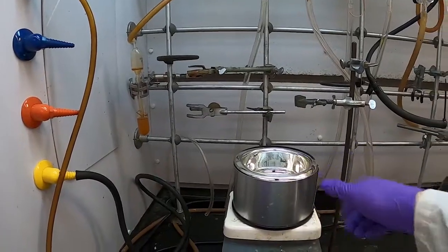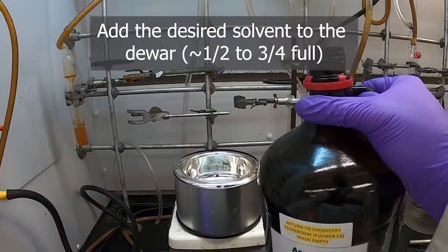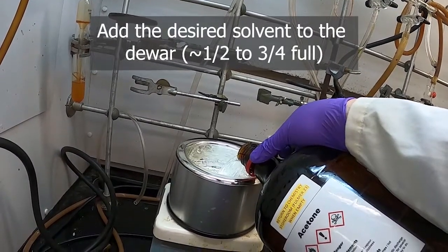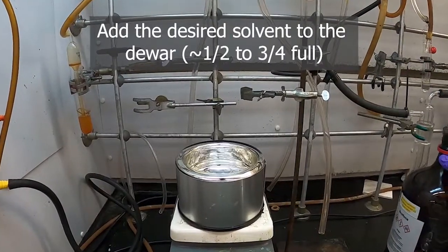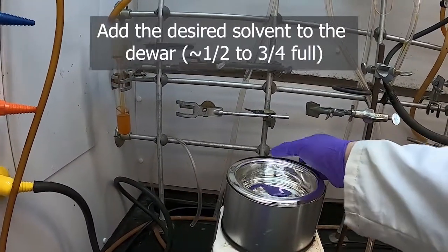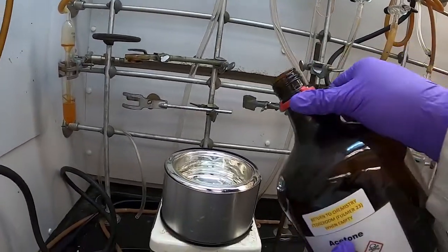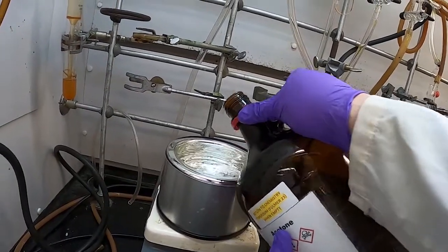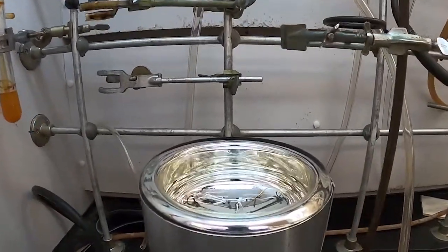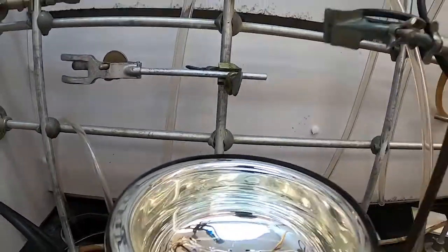So to kind of demonstrate that, we would first fill our dewar with acetone about to the level where we expect our flask to sit. So I've got it filled. It's a mirrory interior there, so I've got it filled to about, there's maybe an inch. I think maybe I could use a little more. It's kind of difficult to tell sometimes how much is in there. Get the camera a little bit closer. You can see the surface of the acetone is right there.